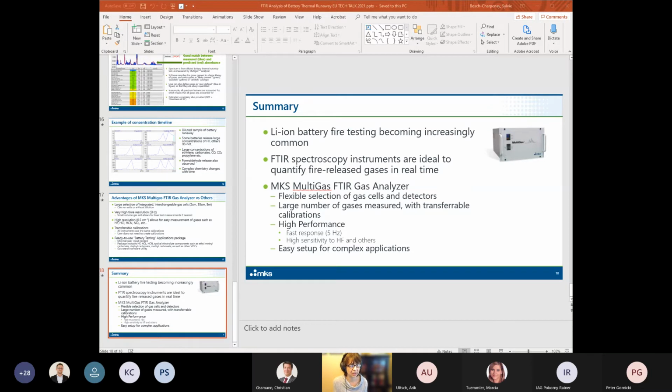When the gas is in the analyzer, it's going to be at 191. If the gas was much hotter, it might end up being hotter in the MultiGas, but typically the volume of the energy contained in the gas is going to be smaller than the heating energy of the gas cell and the heated lines. So it's going to still be at a temperature close to 191.